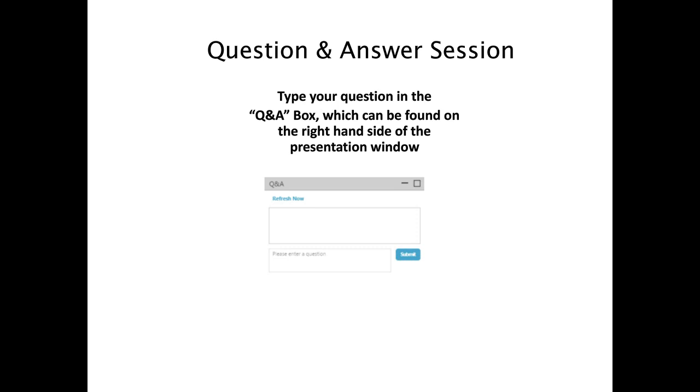We'll begin with our questions. The first question: I can't run 5 or 6 different stationary phases for every method development project. So how can I choose which ones are most likely to work?